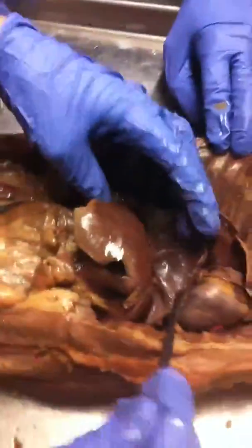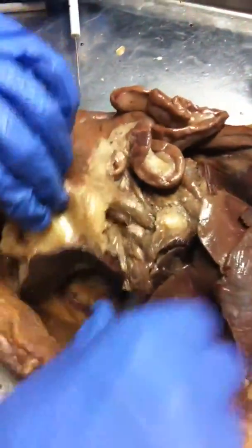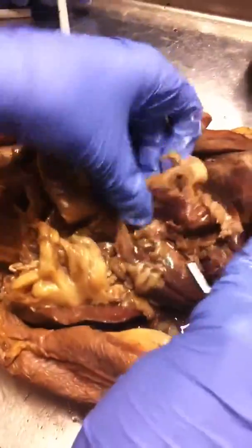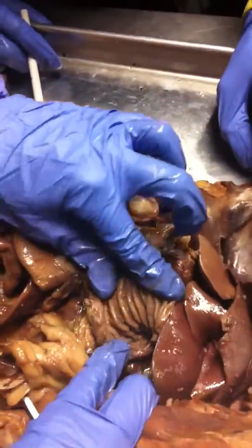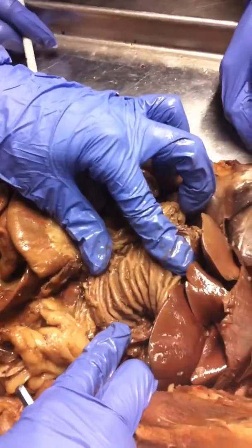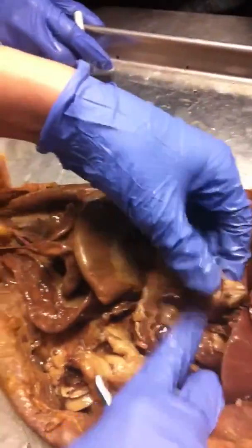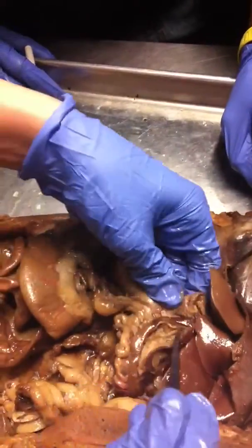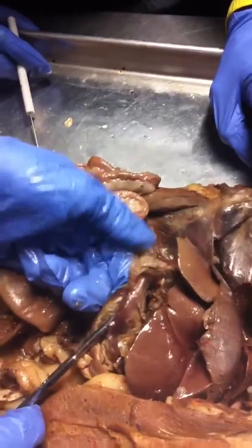All right. Show me the stomach and the rugae again. There it is. There's the stomach, and it's been cut open. You can see the rugae. All right. Pyloric sphincter. Pyloric sphincter would be right here at the end of the stomach. You would have the pyloric sphincter right there.